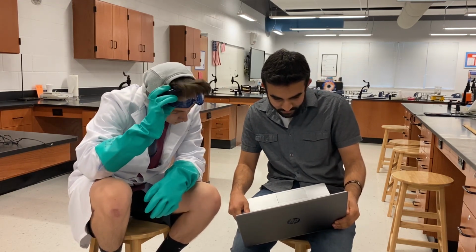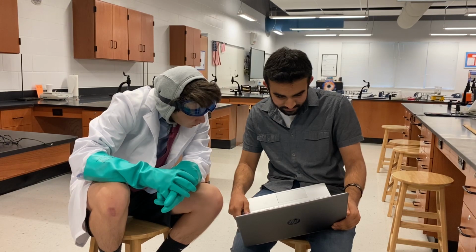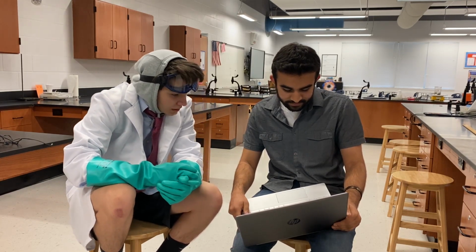In all cases that you have no idea what to do, you should call them. Anyway. Number 7. Work area should be kept clean and tidy at all times. Bring only needed materials to the lab station.